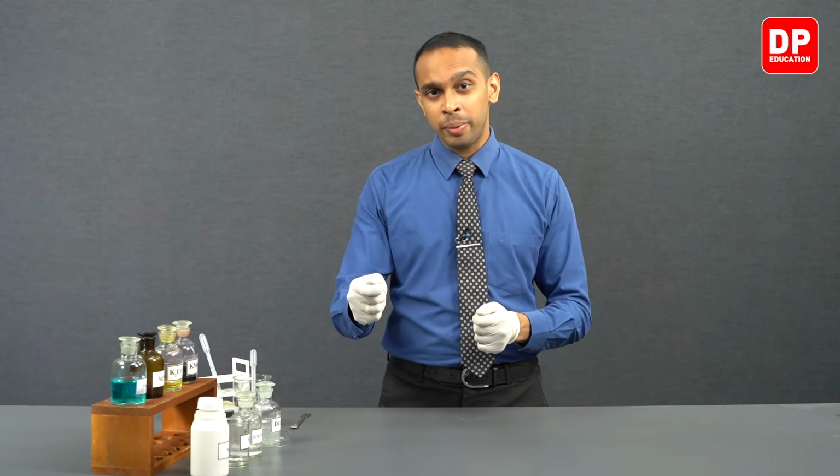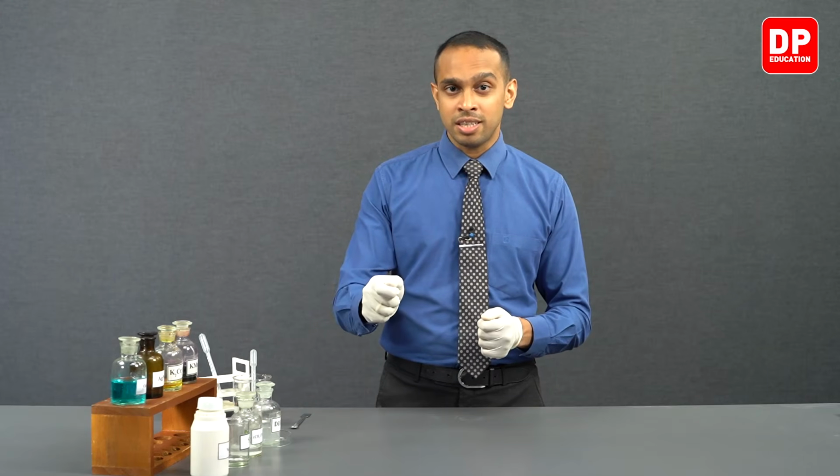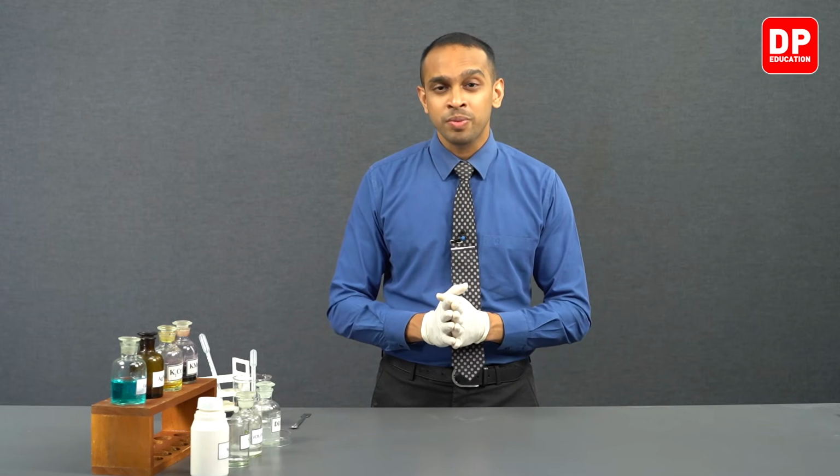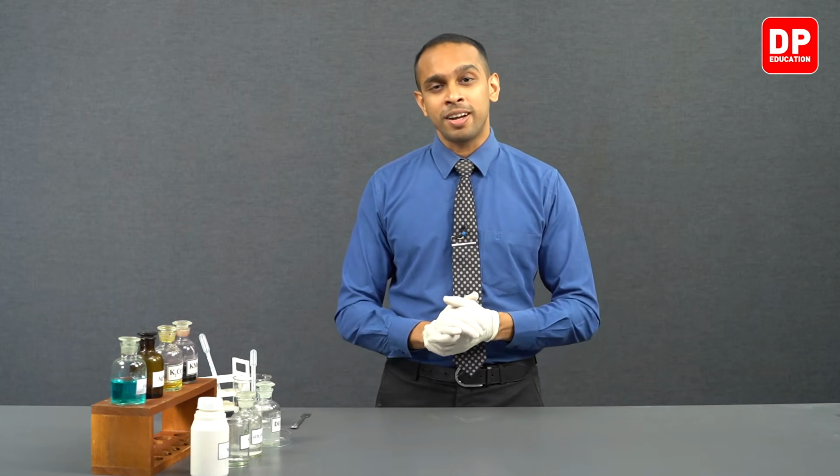However, you can further identify that hydrogen sulfide has been formed by taking a filter paper and dipping the filter paper in lead acetate, and if you expose this filter paper to the hydrogen sulfide gas that is produced, we observed that there is a black color shiny precipitate that is formed, which is lead sulfide.